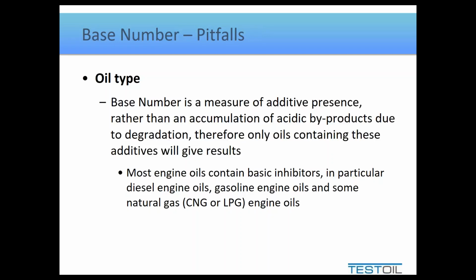So the first question I see says, can we identify the cause of foaming from this test? The test is not mentioned, but of the tests that I have talked about here, no, none of these would really give you a strong idea what is causing oil to foam. The general driver behind foaming of oil, if it is not a mechanical issue, so to cover that off real quick, most foaming problems in my experience, and this is not to say it's always everyone else's experience, tend to be mechanical related.